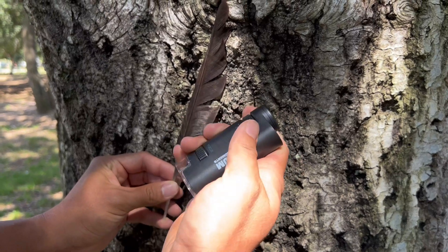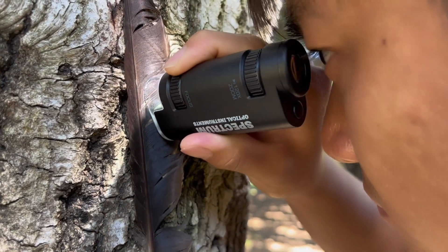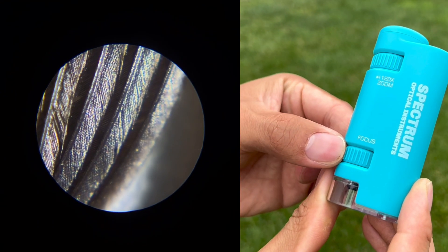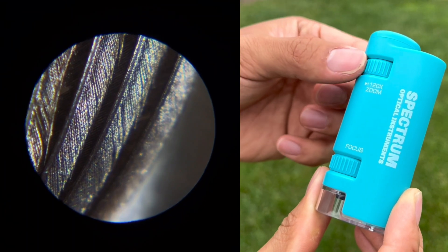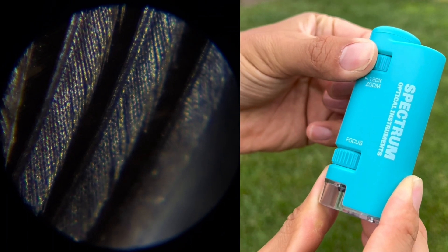Place the microscope against the object to initiate observation. Adjust the focus by rotating the focuser knob until the image appears clear. You can also zoom in or out by rotating the zoom knob. You may need to readjust the focus after zooming.